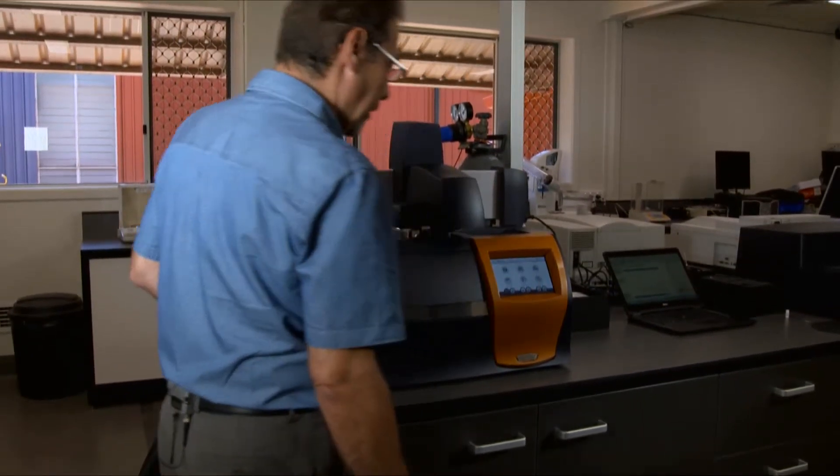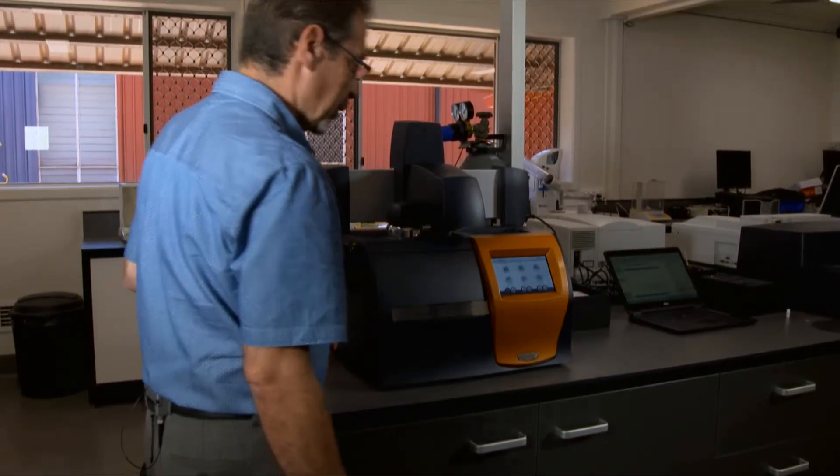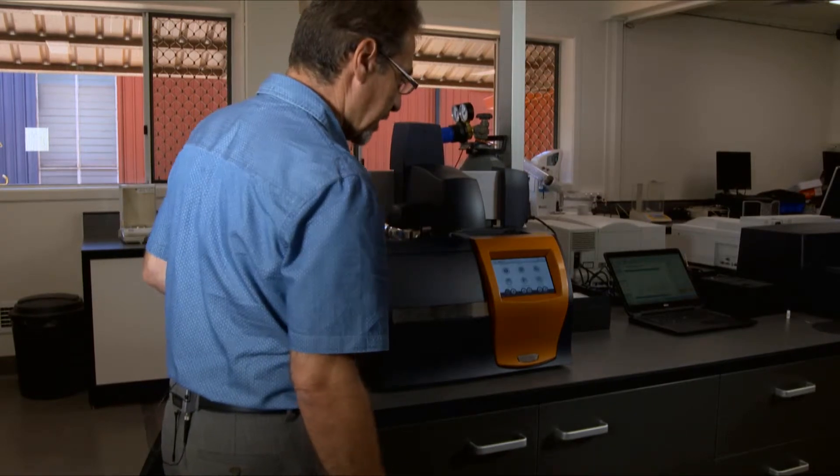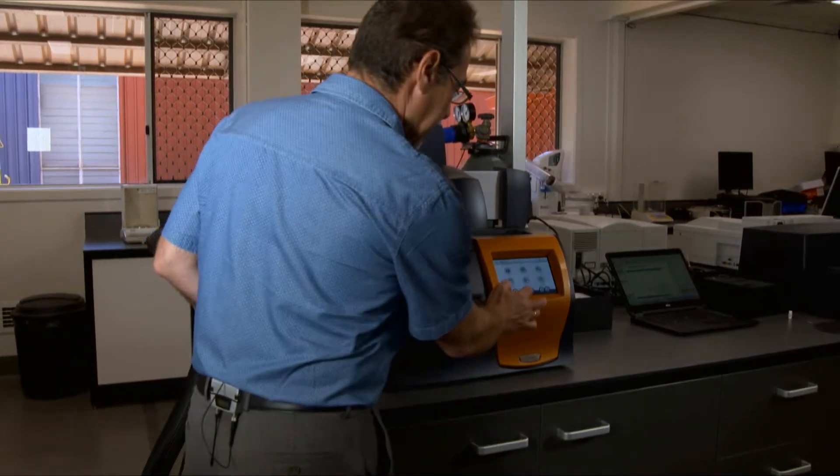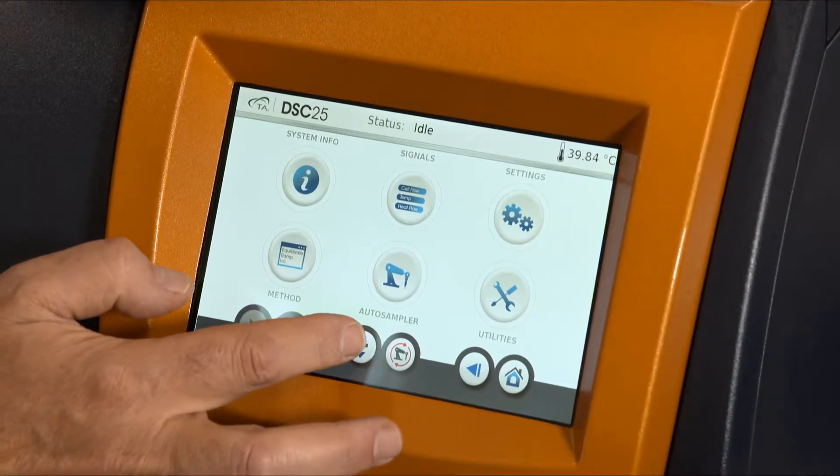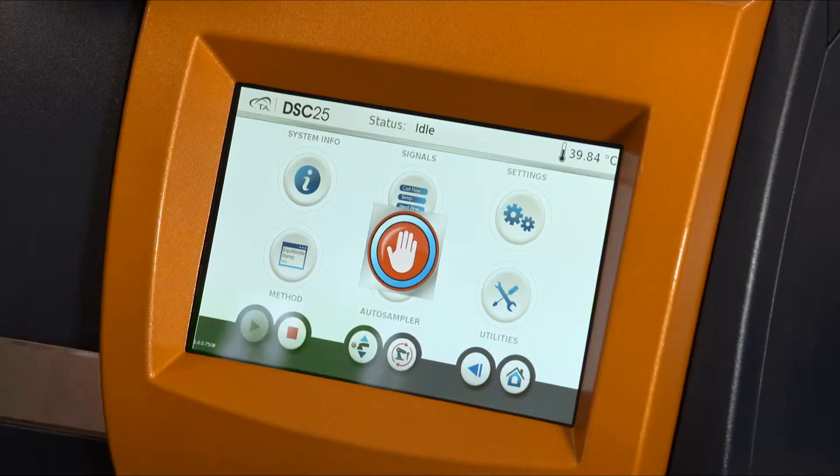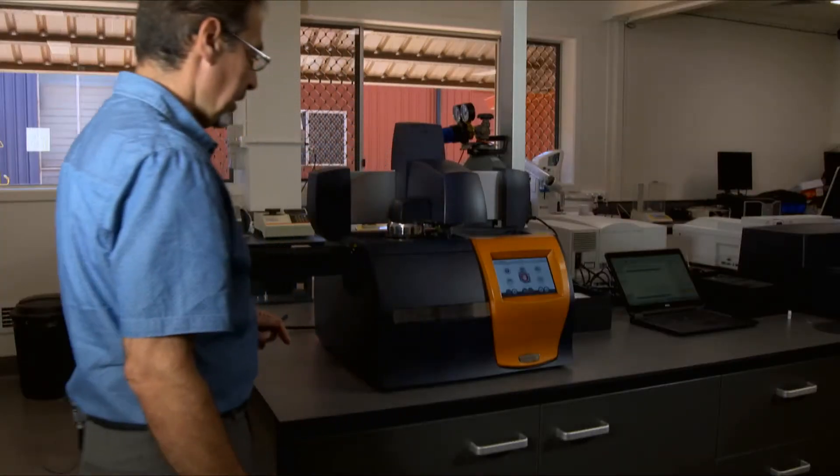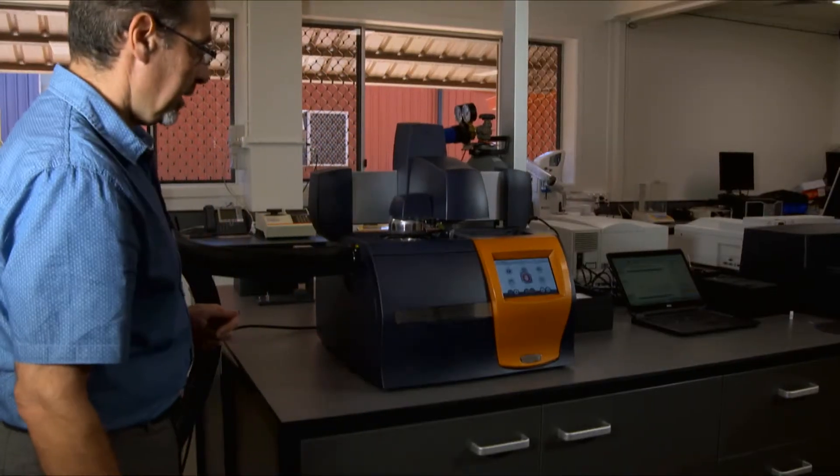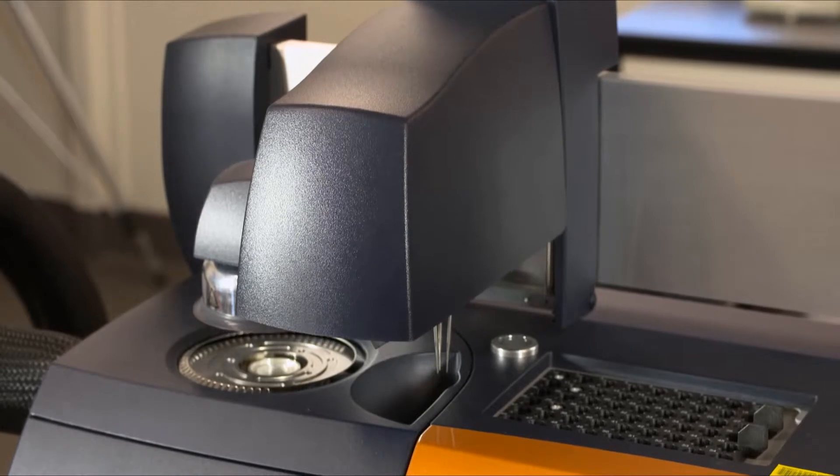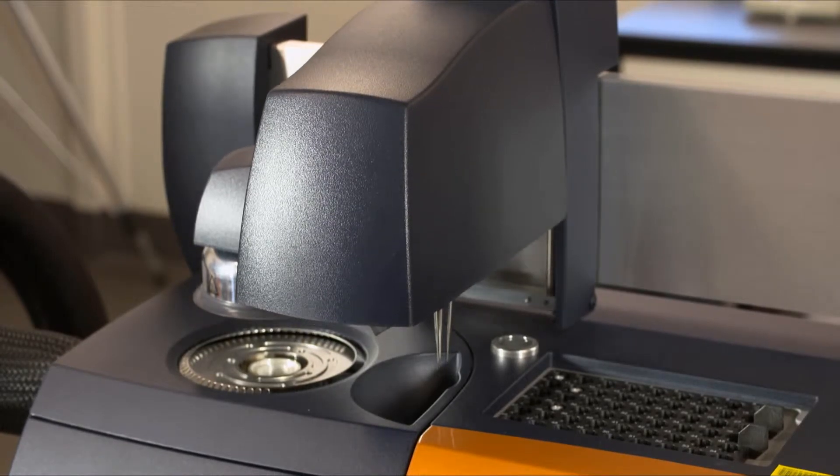The screen here will allow you to perform some operations. For example, if you wish to open the lid, it will go like that.